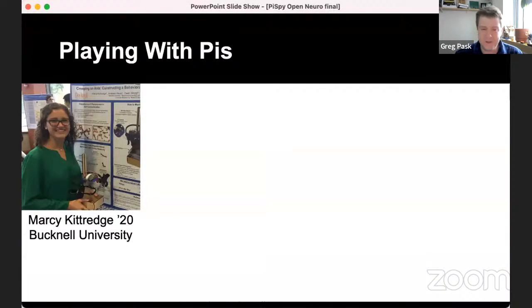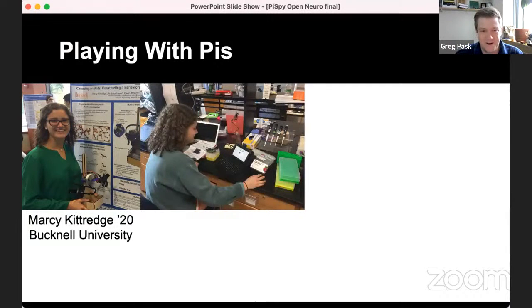So what we started to do, and this project all started when I was at Bucknell University. This is Marcy Kittredge. She really launched this project forward when we started playing with Raspberry Pis, these really cool Linux-based computers that I've used in my personal life for all sorts of things, like home video game systems and jukeboxes for my kids, all sorts of fun things. But I started really playing with them in the lab. And here we have an image of Marcy using the Raspberry Pi for the very first day.